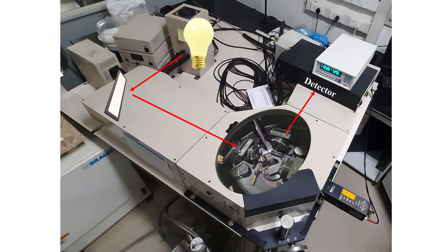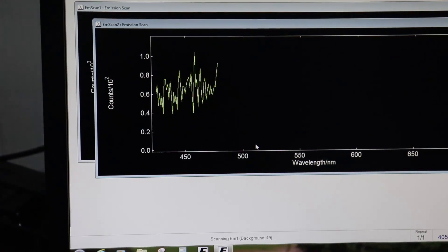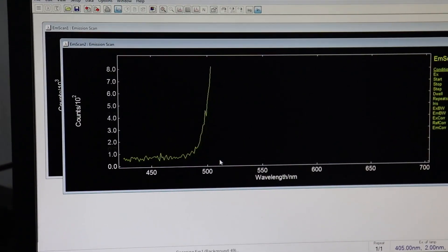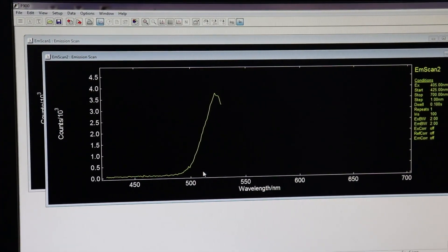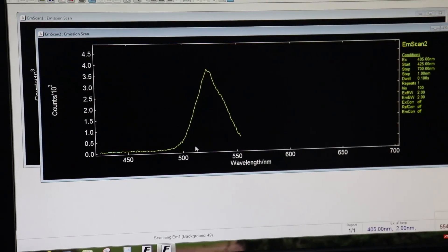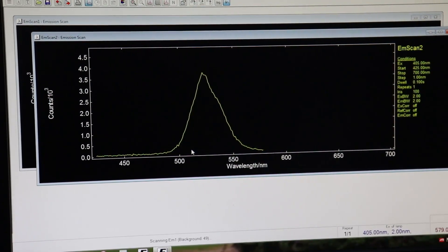After the absorption measurement is finished, we are now ready to measure the emission of the sample. This instrument is used to quantify the photoluminescence of the nanomaterials. The light from the light source is reflected by a mirror at a 45-degree angle, then passes through a lens onto the sample kept in the cuvette, and through another lens it passes to the detector where the photoluminescence response is recorded and displayed. The y-axis records counts multiplied by 10 cubed, quantifying the photoluminescence intensity. The peak position is around 520 nanometers, which corresponds to the band gap of 2.4 eV displayed by cesium lead bromide.